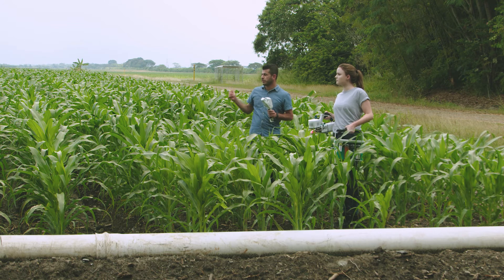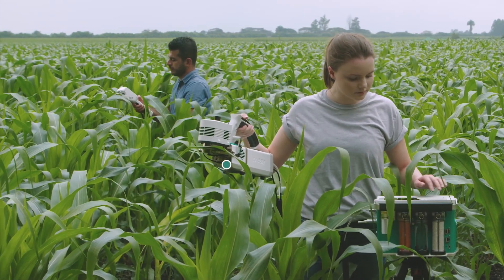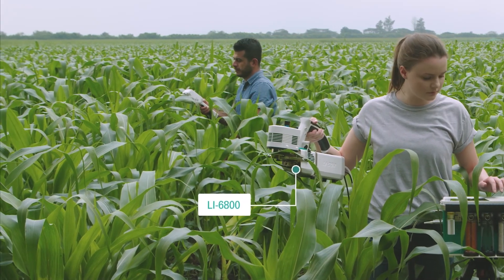Because it's designed for high-throughput sampling under ambient conditions, you can exclude plants that don't need further analysis. Pinpoint which ones are of most interest, then take a more in-depth look using the LI6800 portable photosynthesis system.